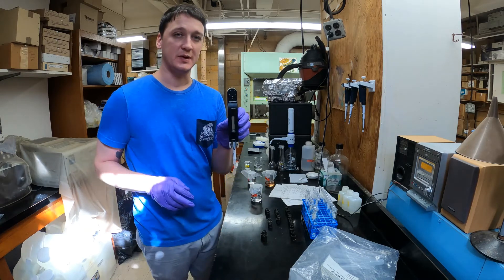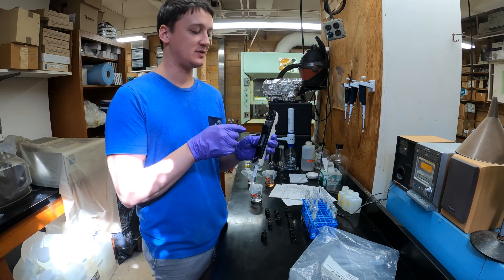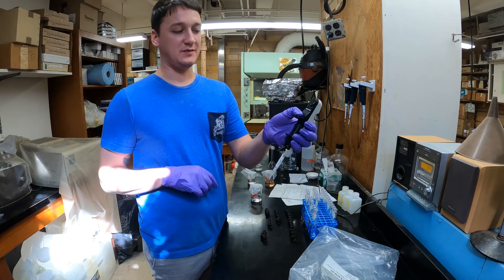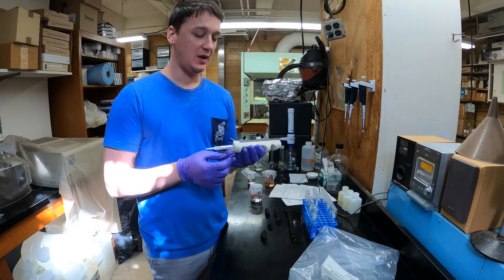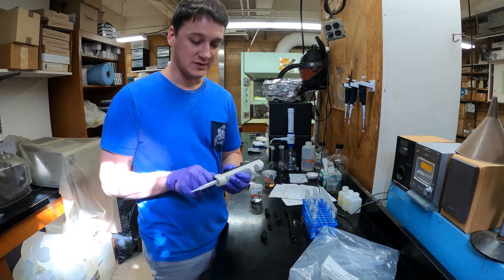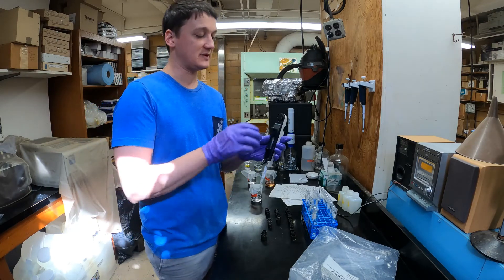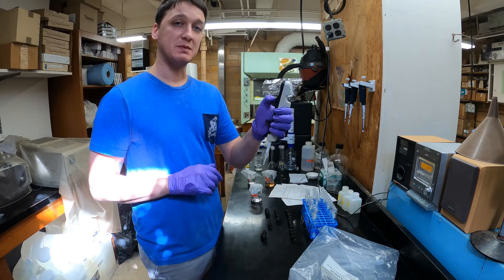We'll do this with a repeater pipette. It has a little dial up top where you can select a certain number. This is set to four right now, which means each time we press down this button it's going to pipette four units of solution out. The units are specific to the tips — with this small tip, one unit equals 50 microliters. So if it's set on four, we're getting 200 microliters out every time we push it down.